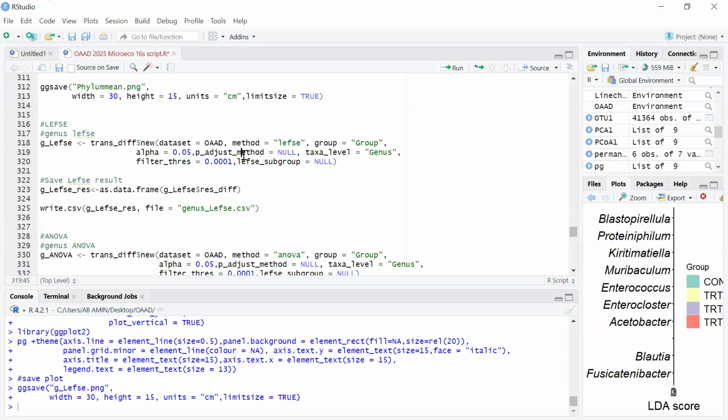Actually, I have a particular microbial data where, when I run the analysis and check the data, I realized there are several OTUs that have not been identified at the genus level. And they form maybe a very large part, that you can see even here at LEfSe, it means they are significant. So is it okay to do some data cleaning and just remove those that were not identified? Or what is your suggestion there? Because you cannot publish something like that, you just put it on. Because I understand. What should I do in such a case?